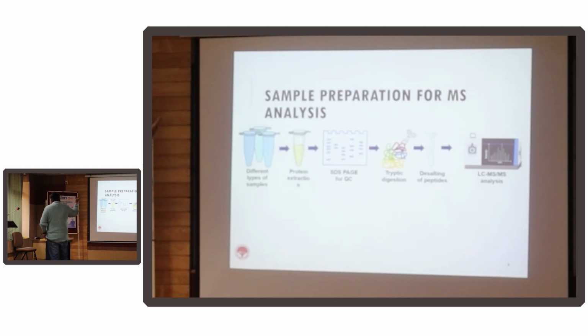Beyond that, we have this instrument that comes in many shapes and forms, from multiple vendors. We have Thermo Scientific, SCIEX, Bruker, and they can always make newer technologies. Bruker has timsTOF Pro, timsTOF Pro Flex. Thermo has come up with Astral. It has Orbitraps. You have Agilent, who makes primarily TOFs, or time of flight based instruments. So instruments can be various, but sample prep techniques are identical for most.